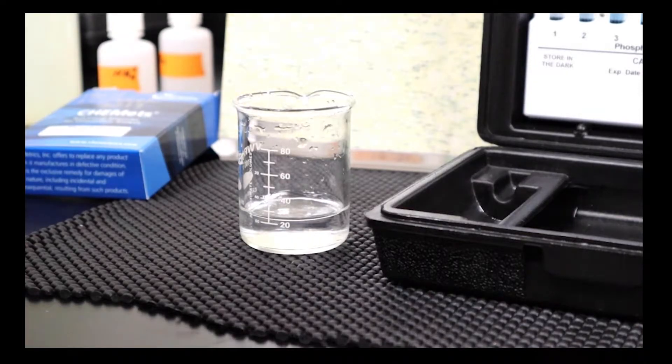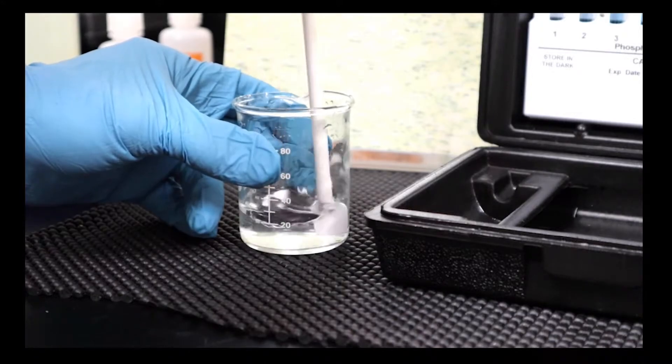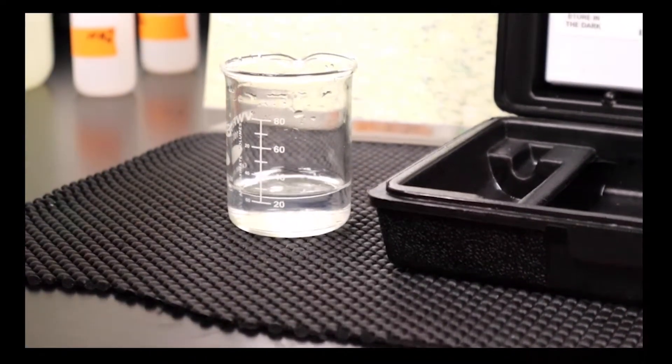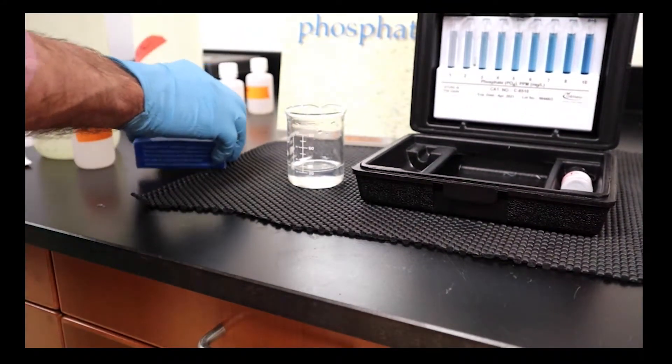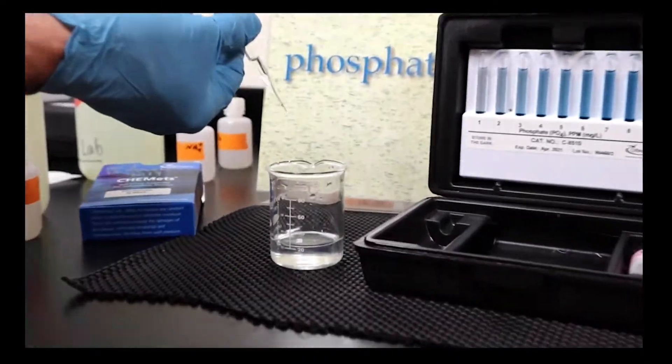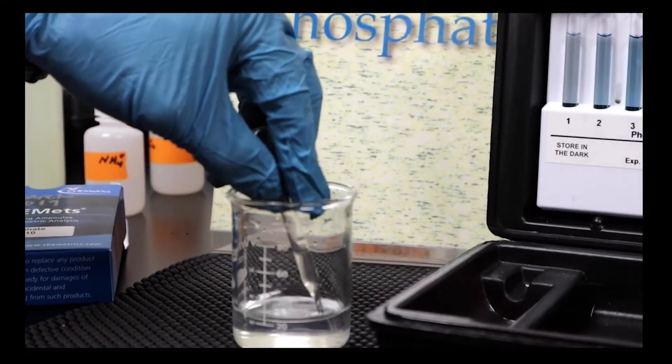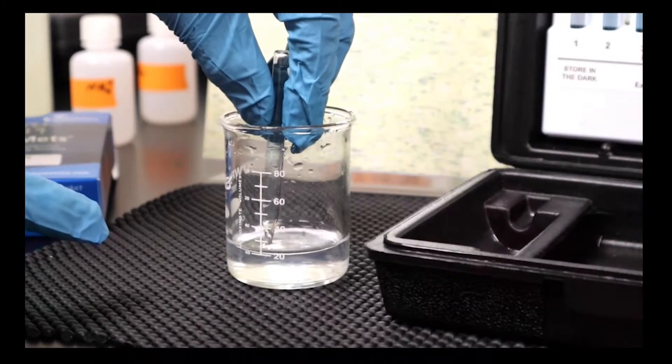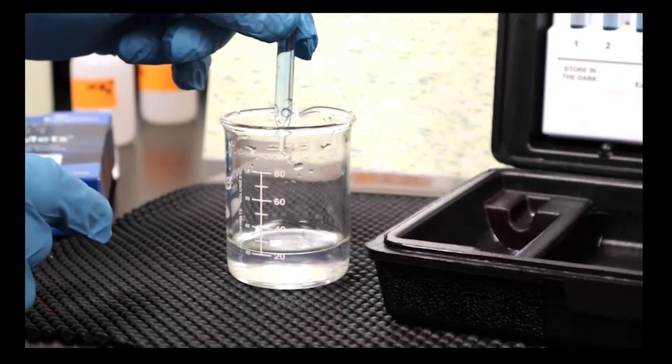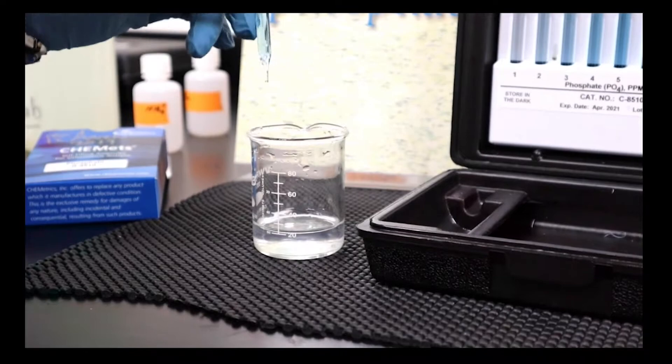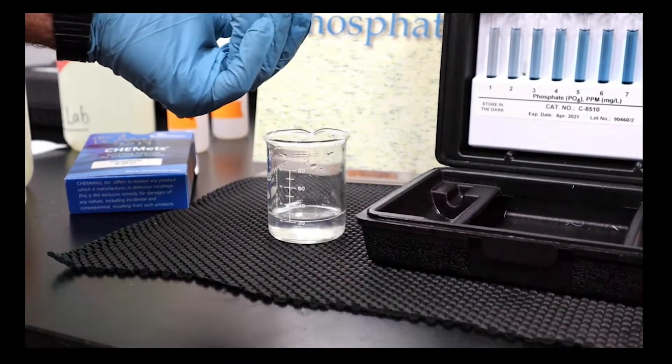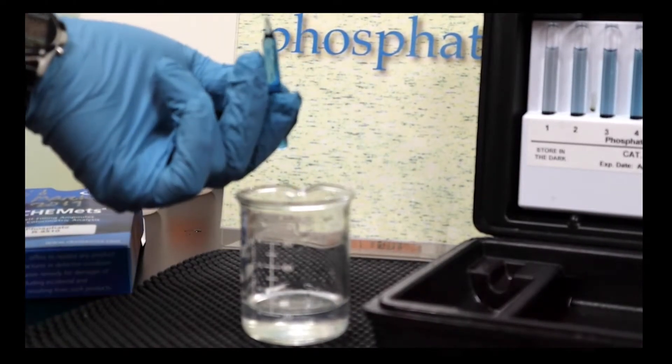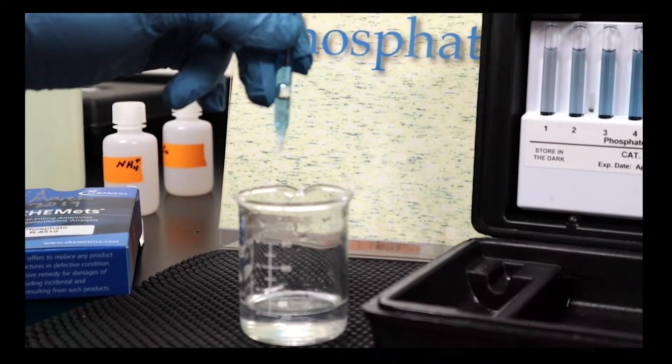There are two drops and we'll stir—good mixing is always important in these analyses. We'll take another vial with reagent two. Again you can see that there's a little bit of reagent in there and a lot of space to draw water up. We break the vial by pressing it into the bottom of the beaker and then let it suck up in there. You can see it looks very much like last time, and we'll keep track of the time. You can see the color starting to develop.